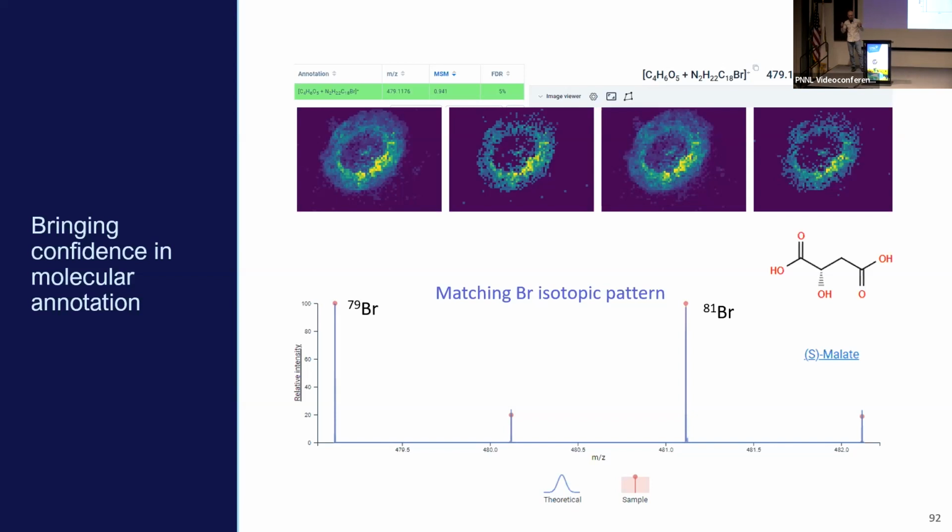This is actually especially important for low abundant molecules, because all our annotation is based upon MS1 data, so based upon a fine isotopic pattern. And in low abundant molecules, like for example phytohormones, you usually don't have the C13 isotope. It is often below the limit of detection of instruments, so we don't have anything to compare with.